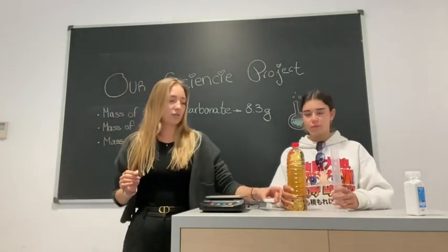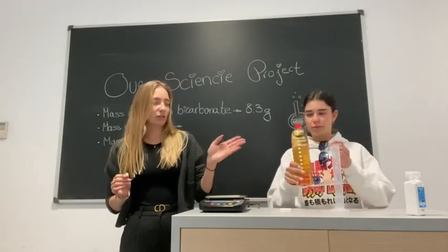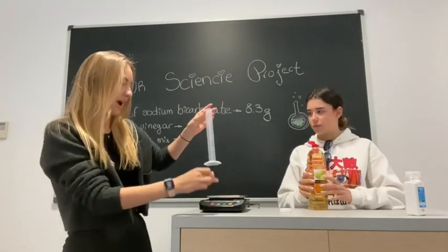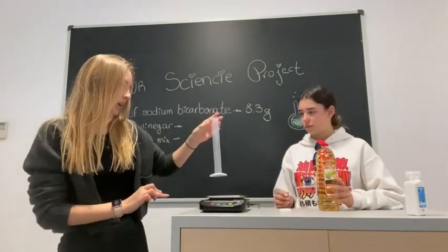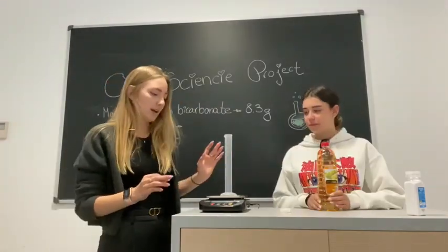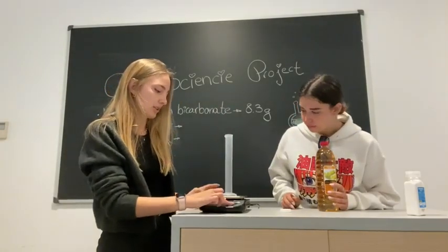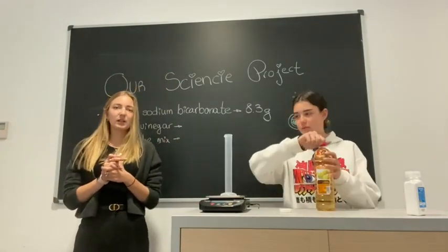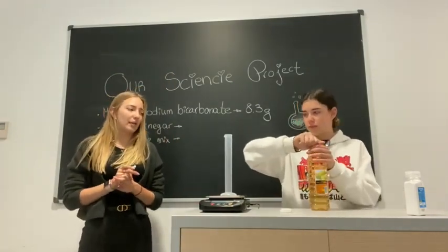Now we're going to leave it here, and we're going to measure also the vinegar. First, we will cancel the weight of the tab. So we will restart it again, and we will measure the weight of the test tube. And we are also going to press the button T. And now we are going to add vinegar there, and we'll see what is the mass of the vinegar.